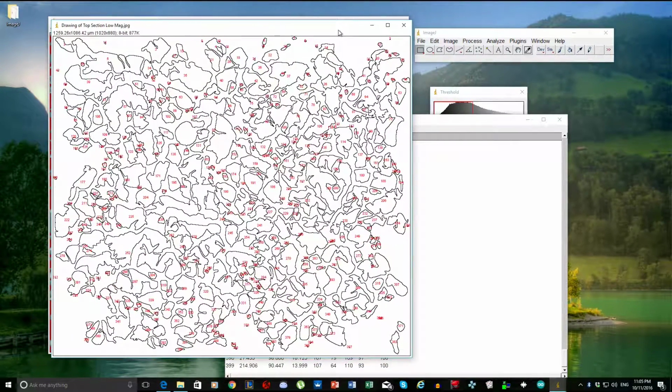This is the image after the software analyzed the whole thing. And as you can see here, the software thinks that this thing is a pore, and it's not a pore, it's just noise, like I was talking before. The bandwidth filter got rid of most of them, but there's still going to be some of the noise around, and this is what you have for noise.